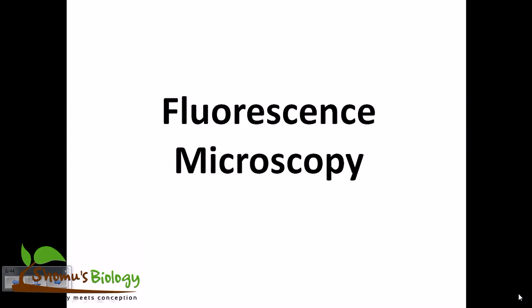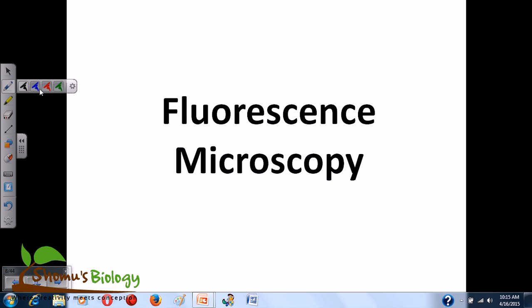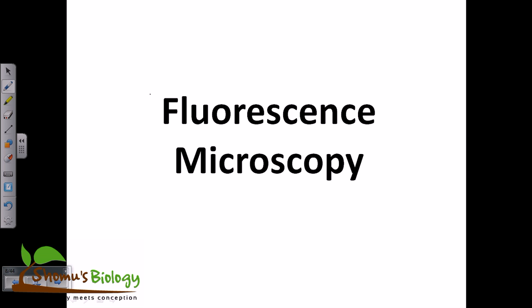Well guys, in this video tutorial we'll be talking about fluorescence microscopy, and more importantly we'll be talking about the fluorescence microscopy principle, because I'm not going to talk about the fluorescent microscope and its structures. I'll just be telling you the basic principle behind fluorescence microscopy.